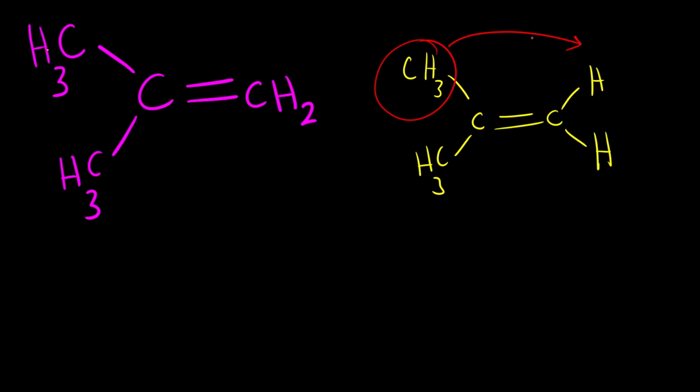Which environment is this methyl group in? It is cis to hydrogen and trans to the other hydrogen. Similarly, the other methyl group also has the same environment.